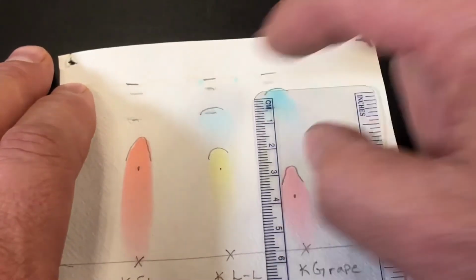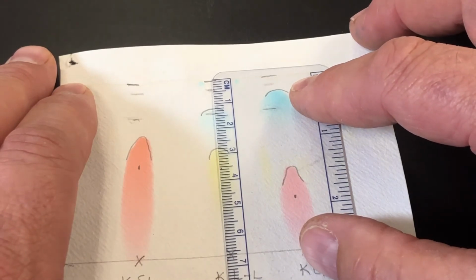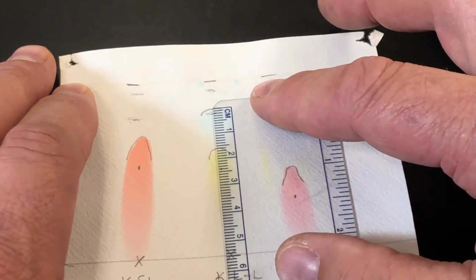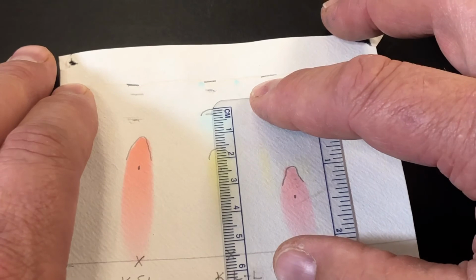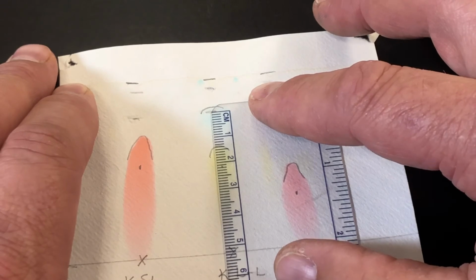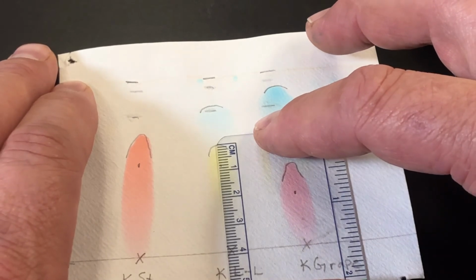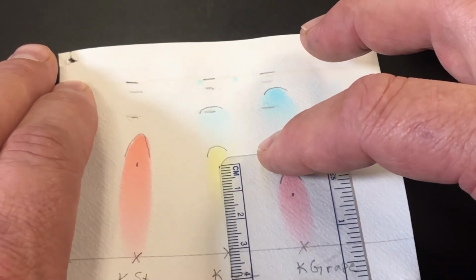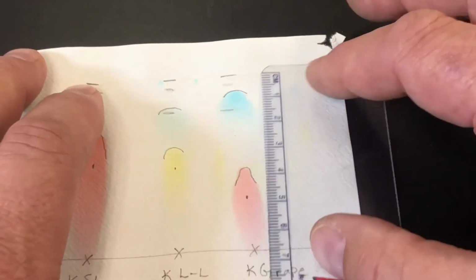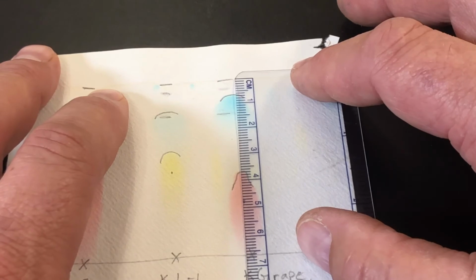For the lemon lime, making green, we had blue and yellow. Again, these two little dots are probably contamination. So here we've got centimeters for the solvent, 6.60. The very end of the blue is 5.45. Center mass is probably about 5.20. The yellow, the very tip, is 3.90. The center mass of that yellow is 3.15 centimeters.